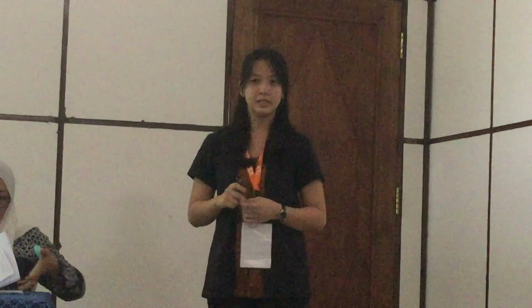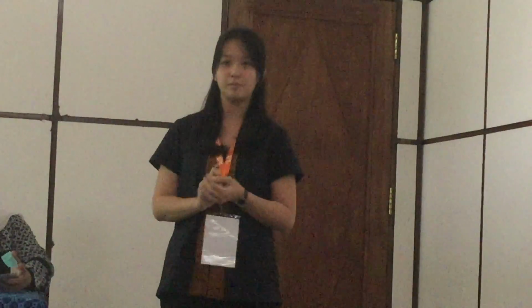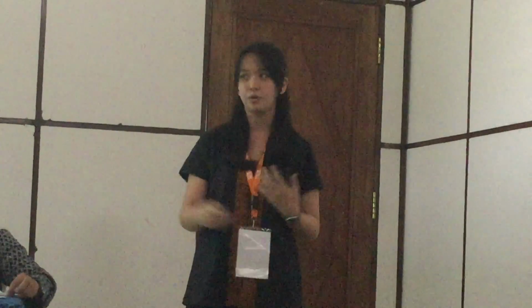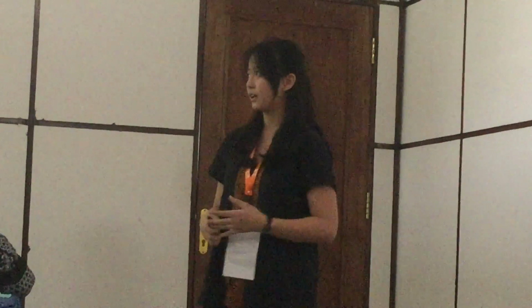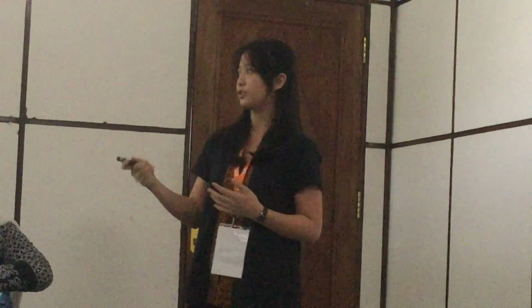All images in the dataset were captured using a 5 megapixel Nikon Digital Sight DS-5MC camera with 10 times 100 microscope magnification. And this is our proposed algorithm, and I'll go through it one by one by explaining the results. So we start with the image preprocessing. We take the original image and convert it to grayscale using luminosity.